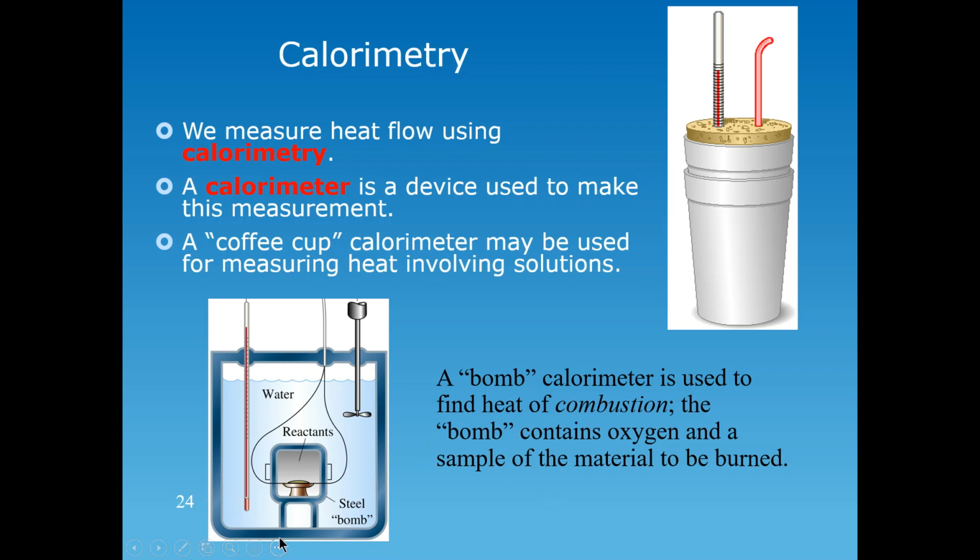So just to give a brief description of the setup here, we have the steel bomb, which is basically a steel encasing, where inside of it you will have your organic substance, which has two wires connected to it or inserted into the organic substance. These are led to an external circuit. When the switch is turned on, this starts burning. As I said before, it produces carbon dioxide and water and heat.